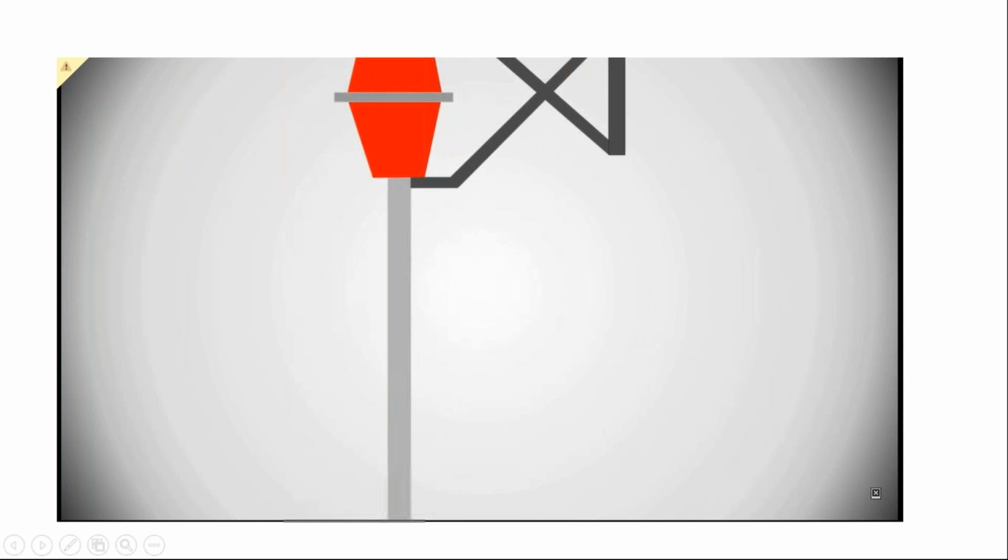The glass tube is lightly packed with cotton wool, previously moistened with lead acetate. The surface of the cotton wool is not less than 25 mm below the top of the tube. The upper end of the tube is then inserted into the narrow end of one of the pair of rubber bungs to a depth of 10 mm. The tube must have a rounded off end.